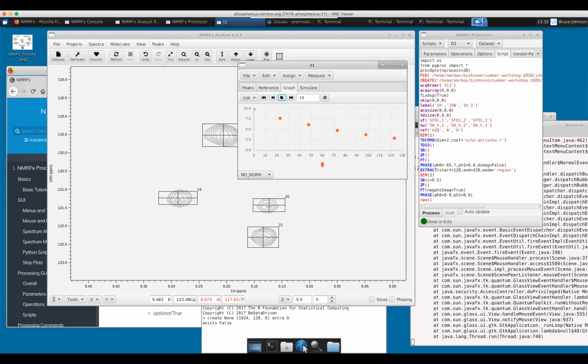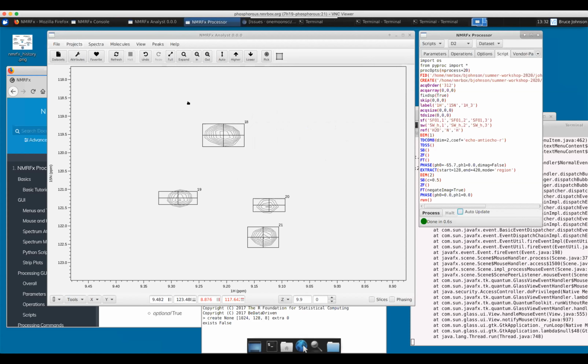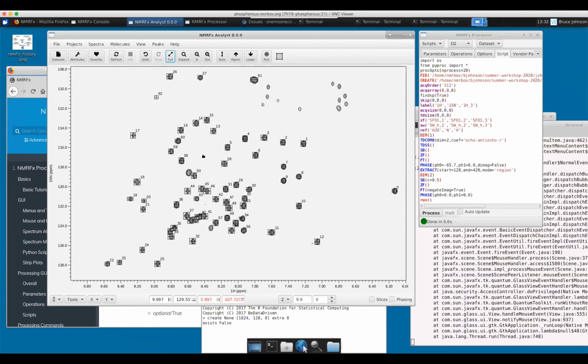It actually makes sense. So having done that measurement, we can then save out this XPK2 file, and it will save what I call an MPK, a measure file, but it'll actually have the intensities that were measured at each position. And we'll go look at that file in a second. So that's basically the gist of what we're doing. We're going to get a peak list, we're going to fit it to all the peaks, and then we're going to save out that measured intensity.